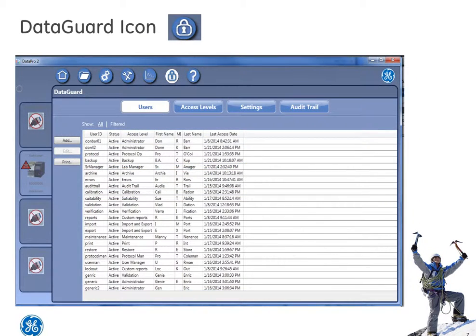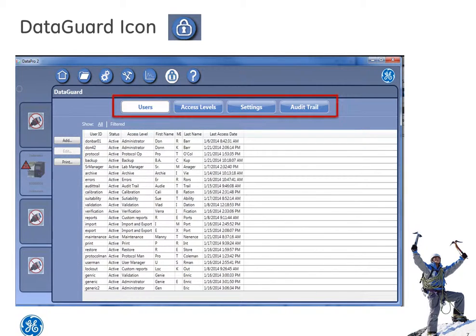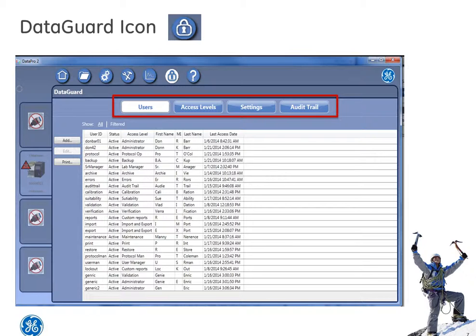Data Guard is the M9's 21 CFR Part 11 feature. This icon allows users to create and manage user accounts and access levels, settings desired for security, and to view the audit trail there on the right.